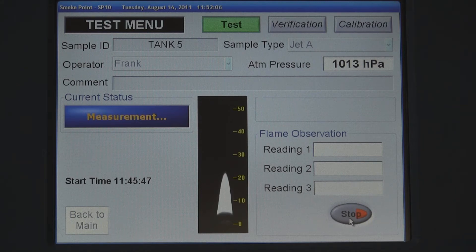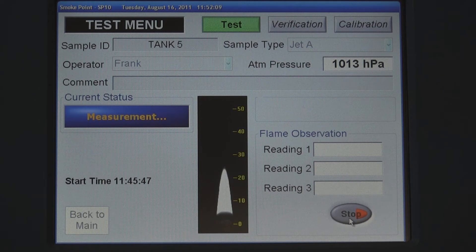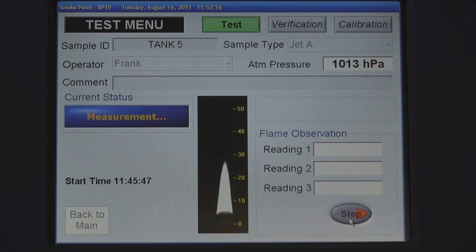Additionally, the SP10 eliminates safety risks linked to the visual observation of an open flame. The test is run unattended, which drastically reduces labor costs. The SP10 is a fully automated instrument with quick, easy, and objective measurement of smoke point.